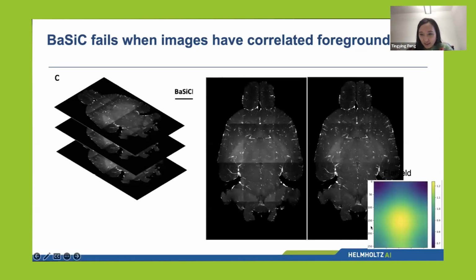And we check, that's the basic flat field, and you can see it's like most other flat fields. If you take a glass, it seems it works fine. But if you look at the image more closely, you see the uneven illumination is actually at the bottom of the image. You can see at the bottom, especially at this corner, it's super bright, and the basic flat field is not taking care of that.